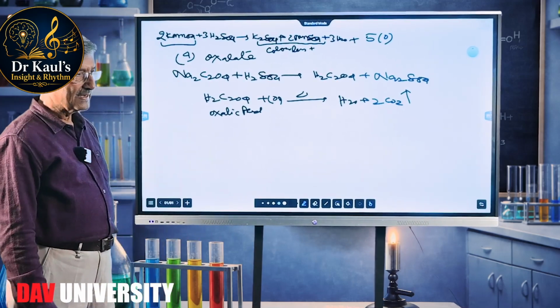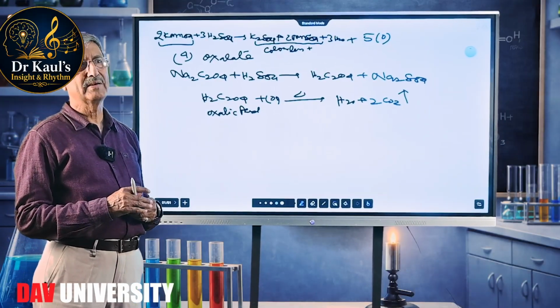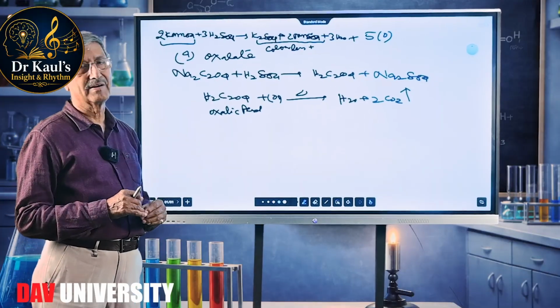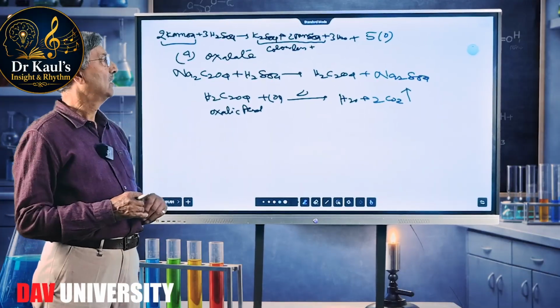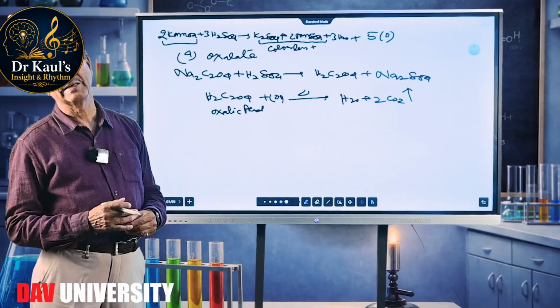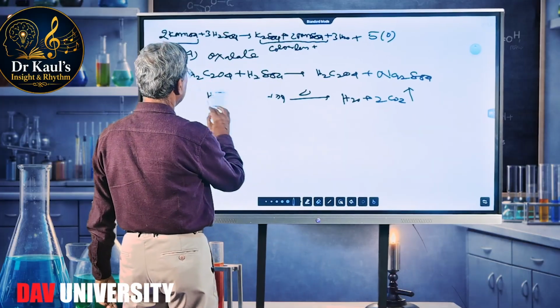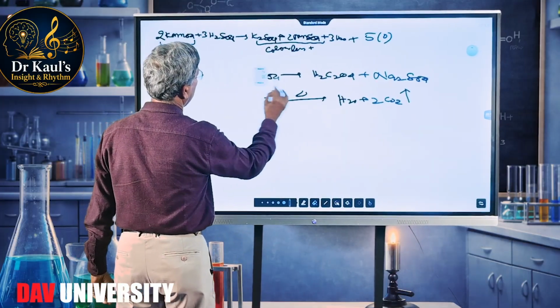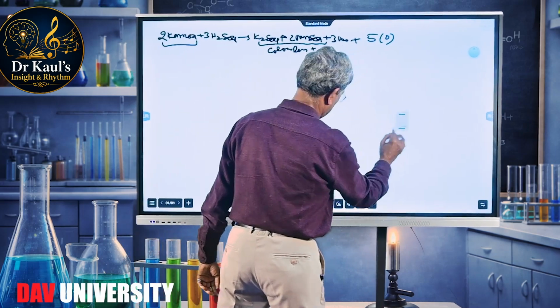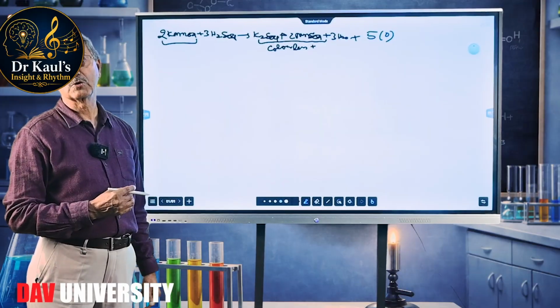Now, as I told earlier, usually at this level we don't provide tartrate ion, so I am not going to discuss the test of tartrate. Otherwise, in case of tartrate also, tartaric acid on oxidation with nascent oxygen gave you, of course, carbon dioxide and water. So this was the first situation, that is, color of the KMnO₄ is discharged with the evolution of a gas. That gas could be having some color and some odor, and it could be odorless also.